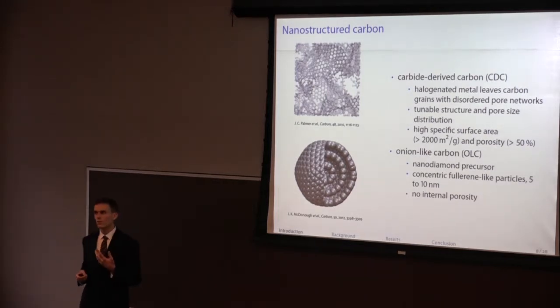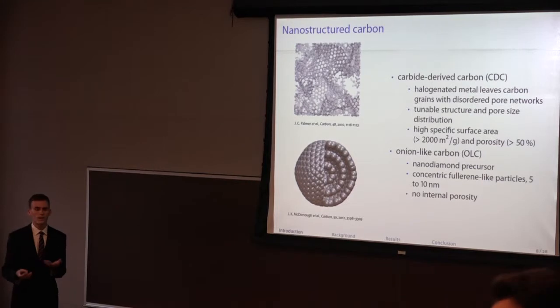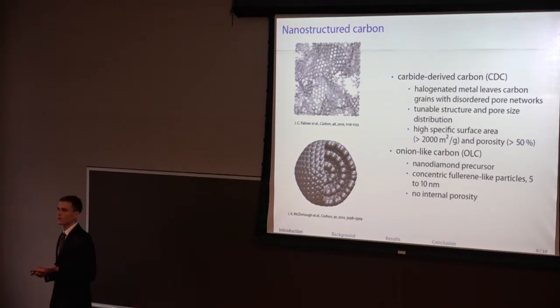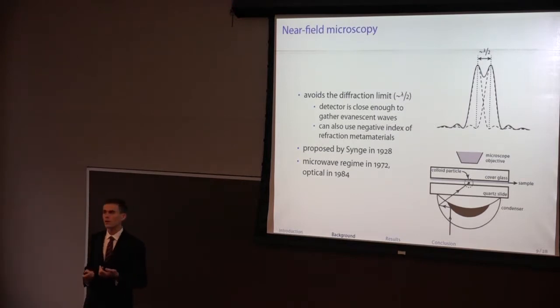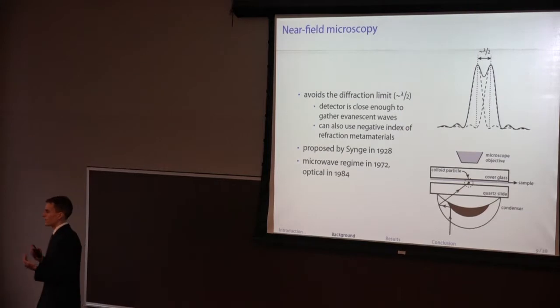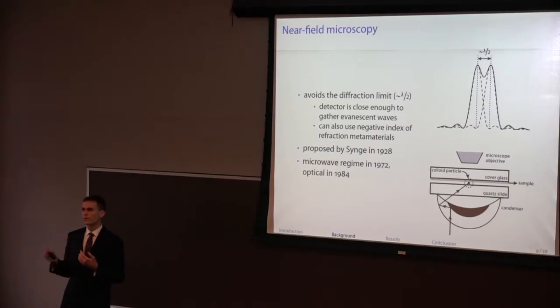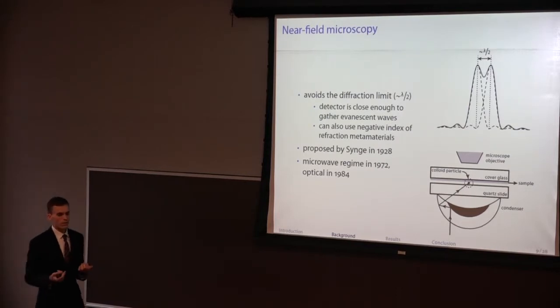Before I move to trying to understand how the field interacts with the inhomogeneity in these samples, we need to go back to the technique and discuss some of the underlying physics. This microwave impedance microscopy represents an instance of near field microscopy. In near field microscopy, away from any electromagnetic source, you usually define the space in terms of a near field and a far field. Ordinary optical microscopy exists in the far field because the mathematics of dealing with the fields is a little bit easier.